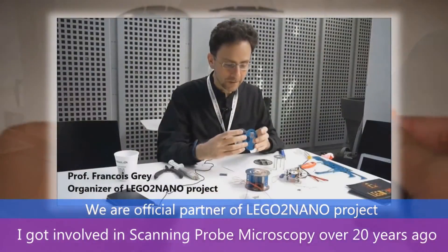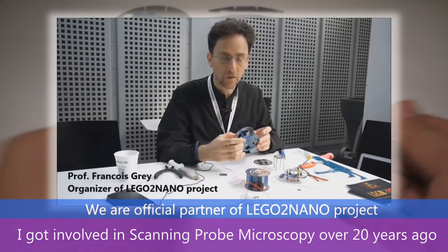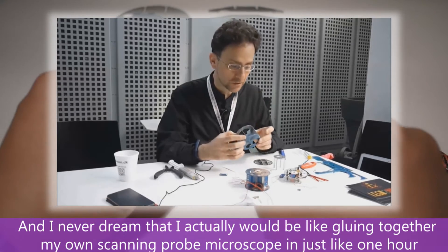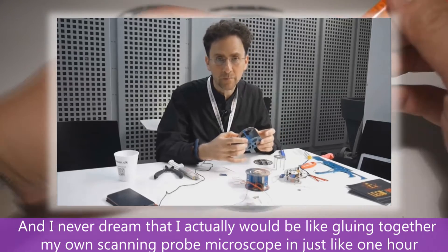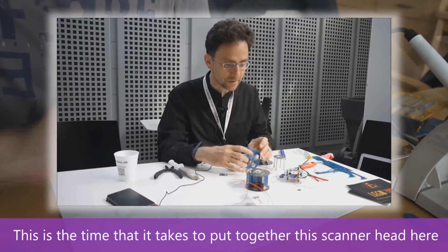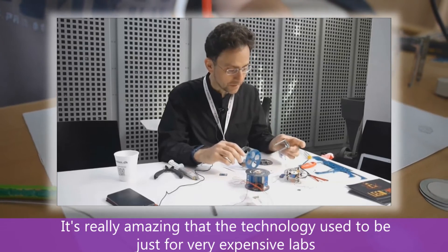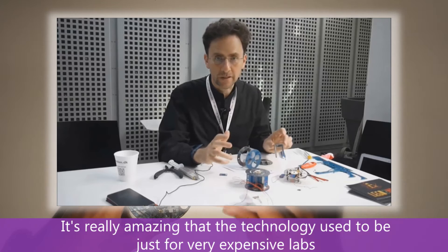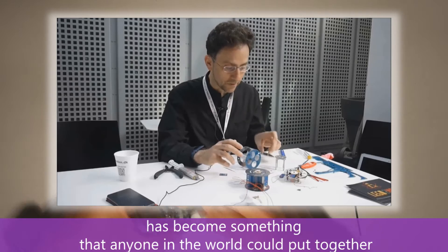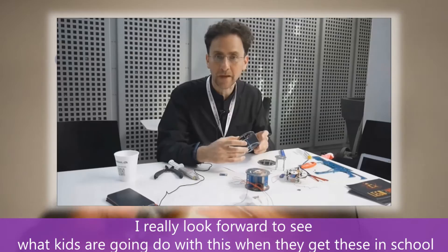I got involved in scanning probe microscopy over 20 years ago. I'm a scientist who worked in this field and I never dreamed that I'd actually be gluing together my own scanning probe microscope in just one hour. This is the time it takes to put together this scanner head here. It's really amazing that a technology that used to be just for very expensive labs has become something that I think anyone in the world could put together, and I really look forward to seeing what kids are going to do with this when they get these in school.